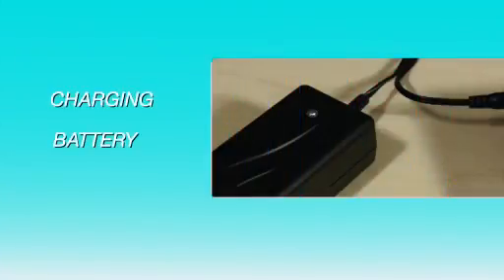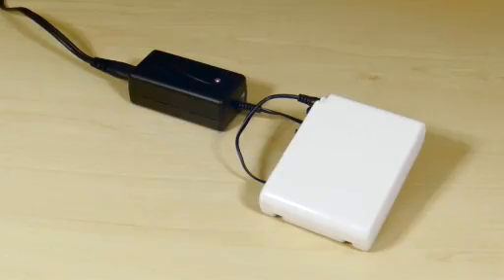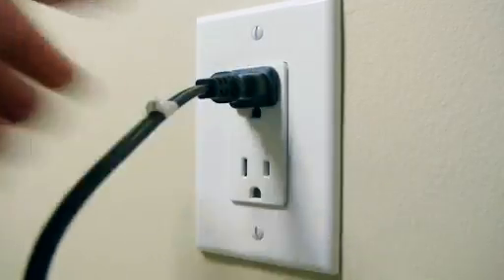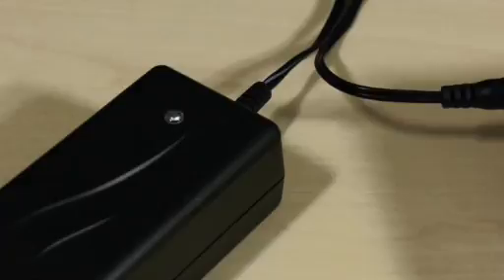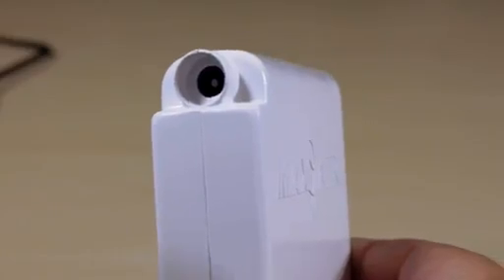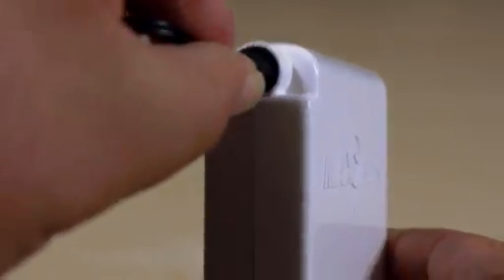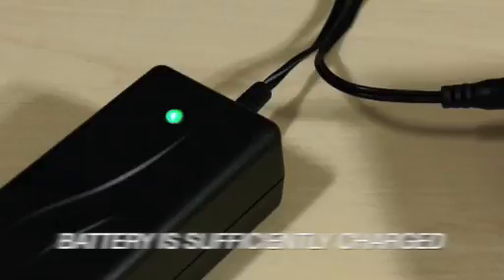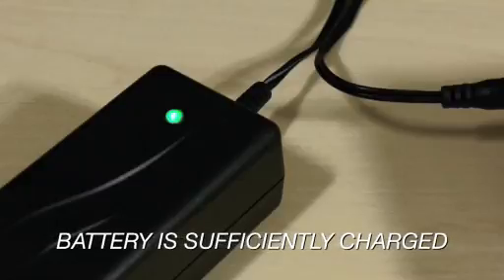Charging the battery. To charge the lithium-ion battery, be sure the charger is connected to a working outlet. The charger green LED will illuminate when it is connected to an active outlet. Connect the battery to the charger. If the charger green LED remains lighted after a few seconds, the battery is sufficiently charged for reuse.